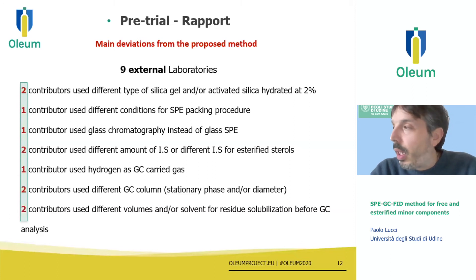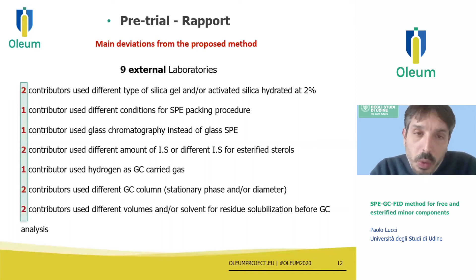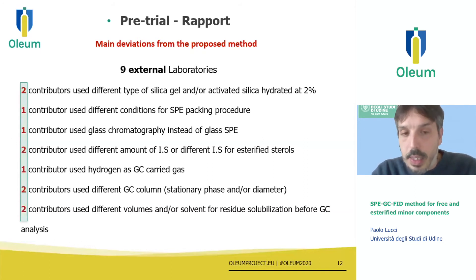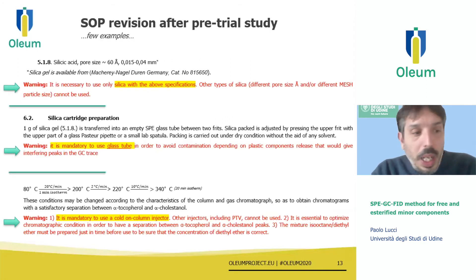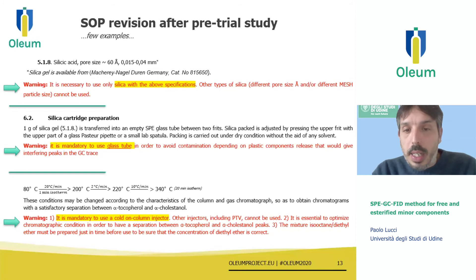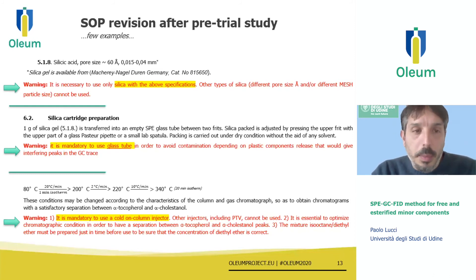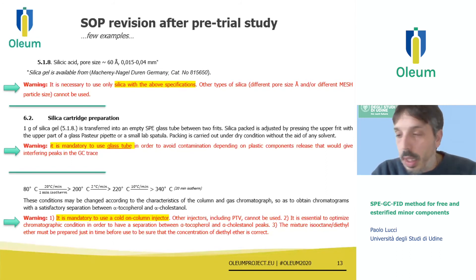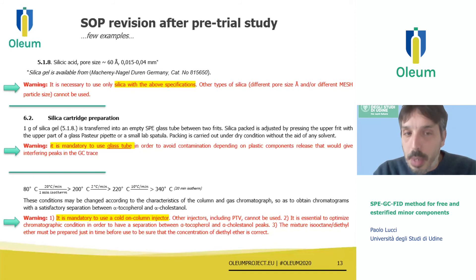Deviations included changes in the solvent employed, the type of injection mode, and the type of silica used, among others. This was not a good experience analytically, but it was a really important exercise for the improvement of the SOP to be delivered to labs participating in the final trial proper. As a result, we added several warnings to the SOP — about the necessity to use a specific type of silica, the use of glass tubes, the mandatory use of cold-on-column injection, and how to integrate the chromatogram — in order to avoid mistakes in the trial proper.